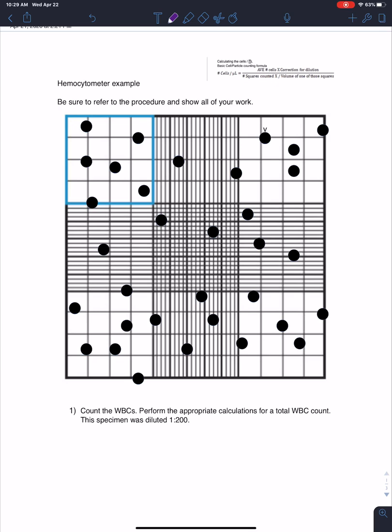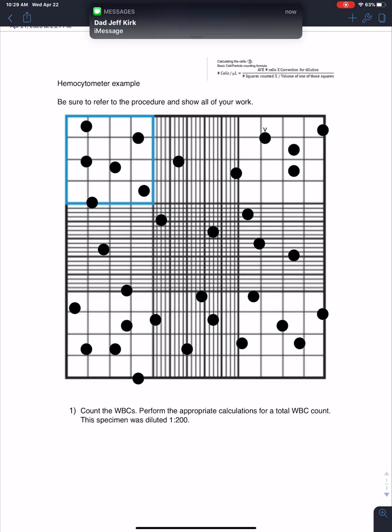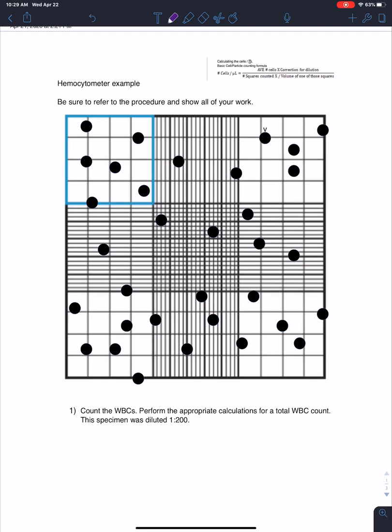Hi guys, we are going to look at counting a manual cell count using a hemacytometer. Normally this is something you will have under a microscope. It's definitely much more difficult counting and focusing to find the cells under the microscope. So this actually should be pretty easy, but I do want to go over some basic rules with you, and the calculation, of course. We're going to try to understand the calculation as much as possible.